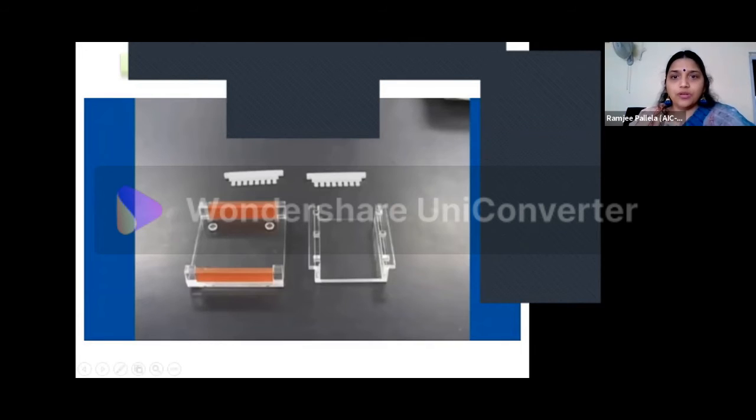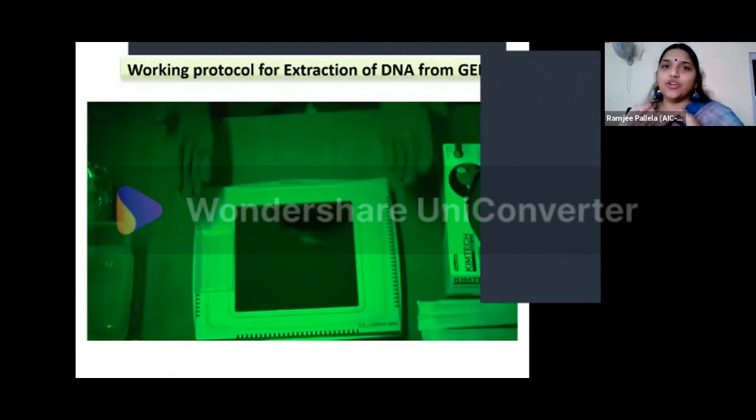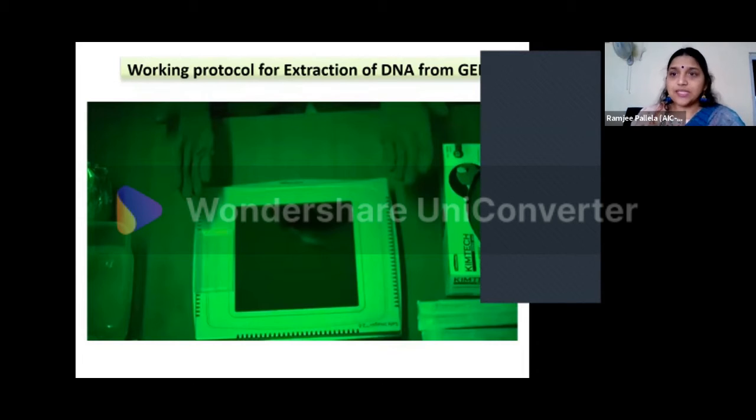Now coming to the next step. Once you have made your gel, you have put your sample, you have run your sample, and you get the bands. Now you need this particular DNA for sequencing. Most of the times what happens is, I told you that we have put 25 microliters as the reaction mixture initially. Out of that, only 10 microliters we have used for the gel checking. For example, the remaining 15 microliters is still there. So with that 15 microliters, we can put a sequencing reaction.